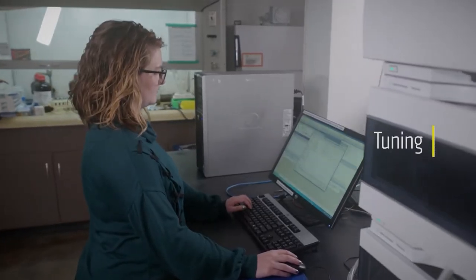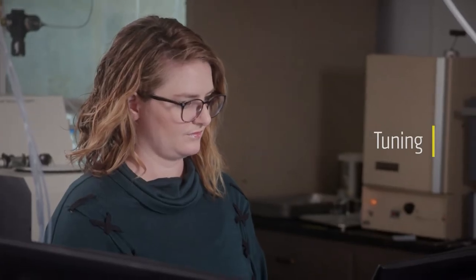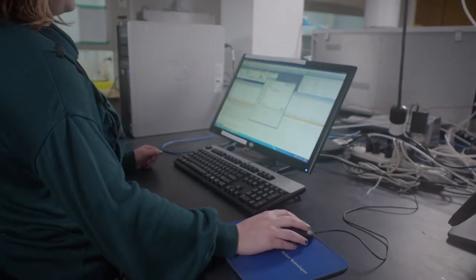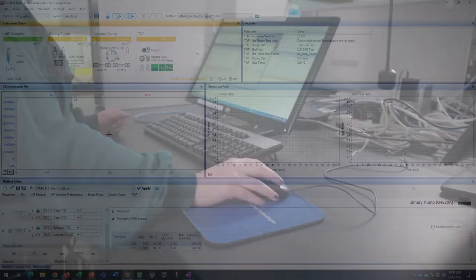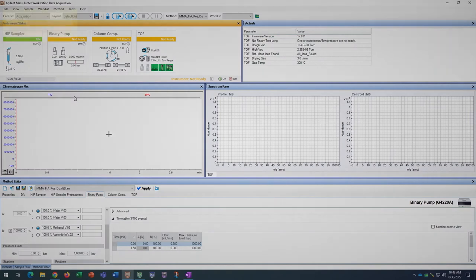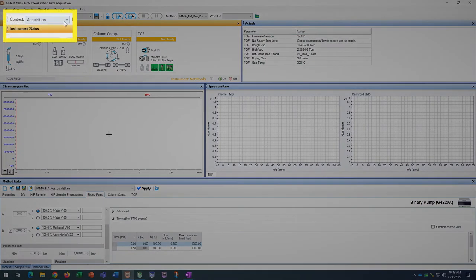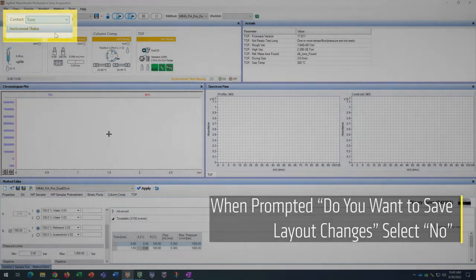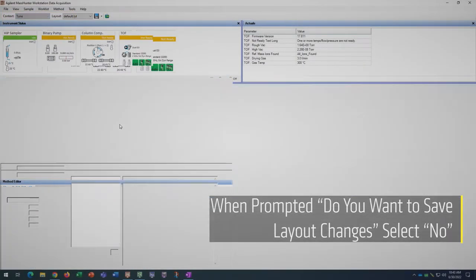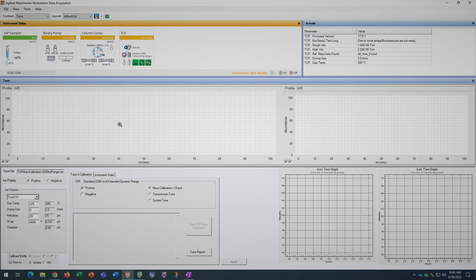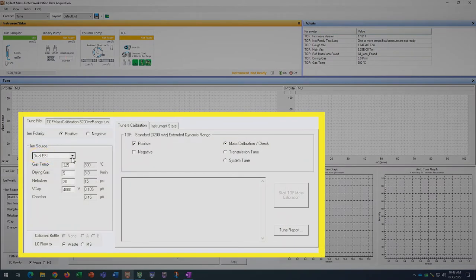Next, we will run a check tune to make sure the instrument is operating at optimal sensitivity and is generating a predictable response across a range of masses. For the purpose of this example, we will be running a positive tune only. In the context menu, select tune. In the tune menu at the bottom, make sure dual ESI is selected in the ion source dropdown menu. In the tune and calibration tab, inside the TOF box, make sure that positive and mass calibration slash check are selected.